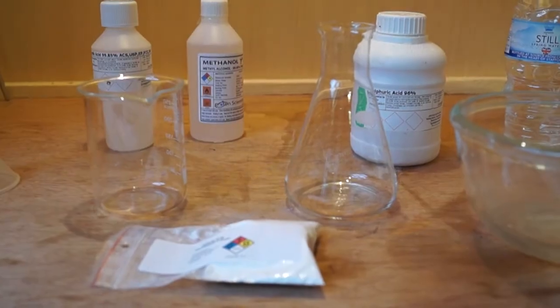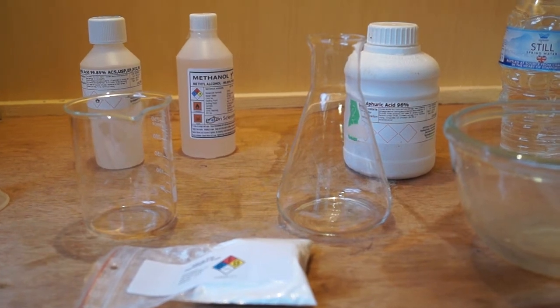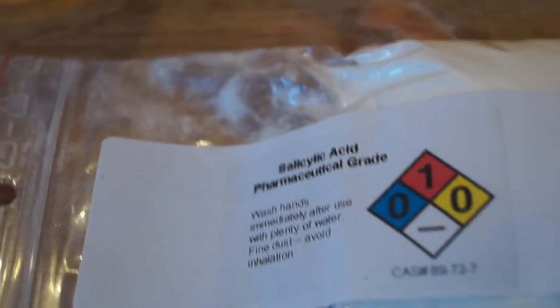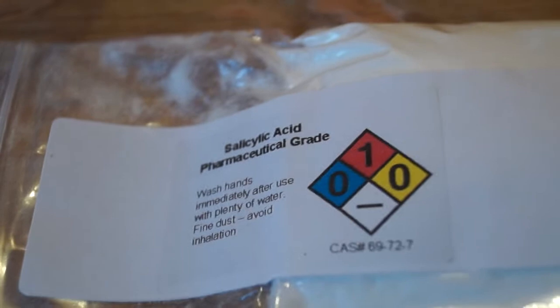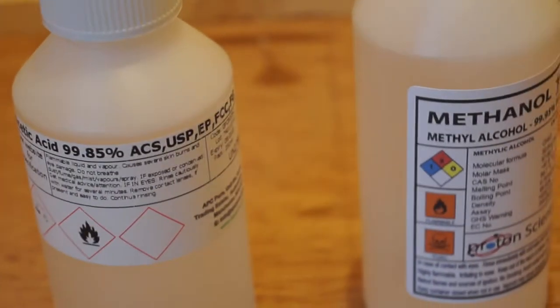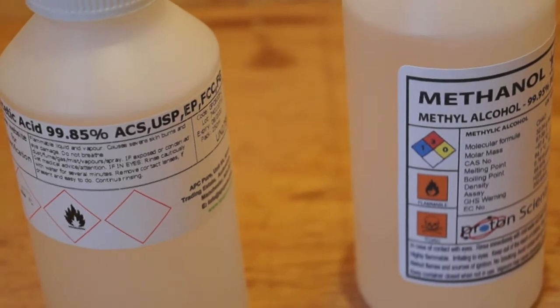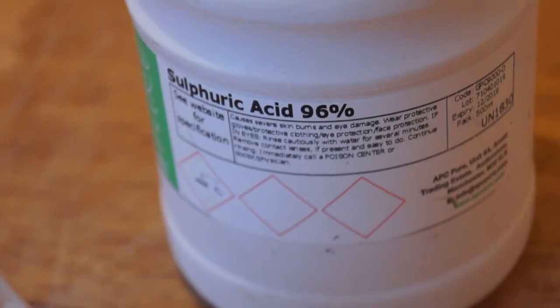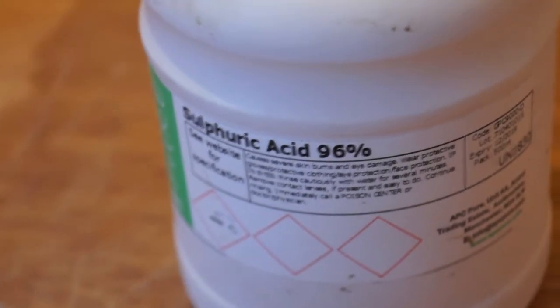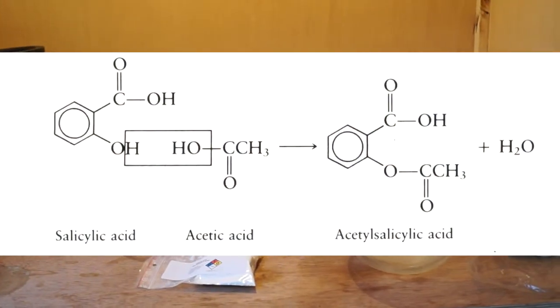Hello, and in today's video I will show you how to synthesise aspirin using salicylic acid and acetic acid. The reaction I am using is an esterification reaction. Usually you would react salicylic acid with acetic anhydride for a reaction giving a high yield, but due to the fact that I couldn't get my hands on any acetic anhydride, I settled for using acetic acid.